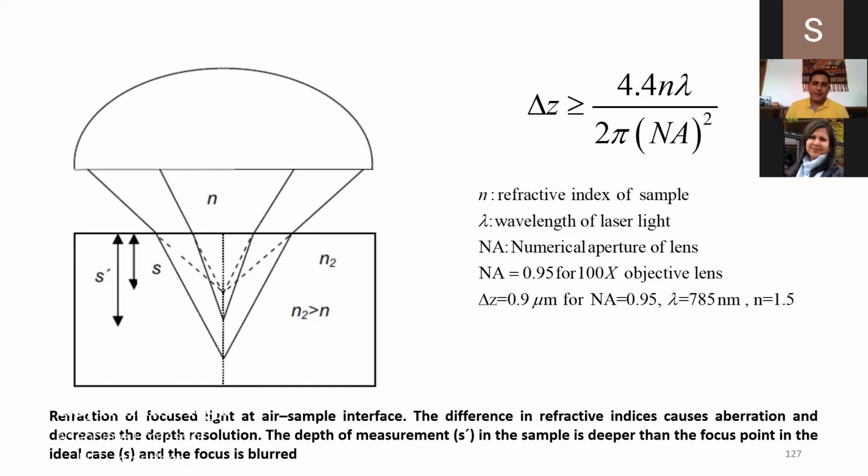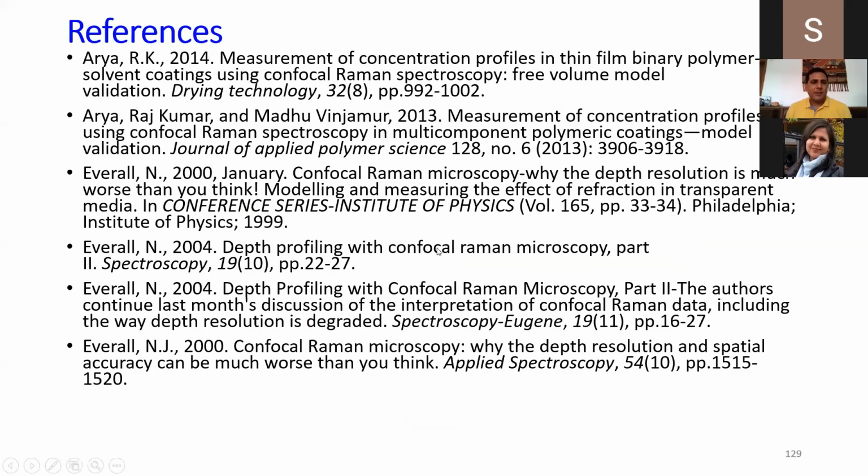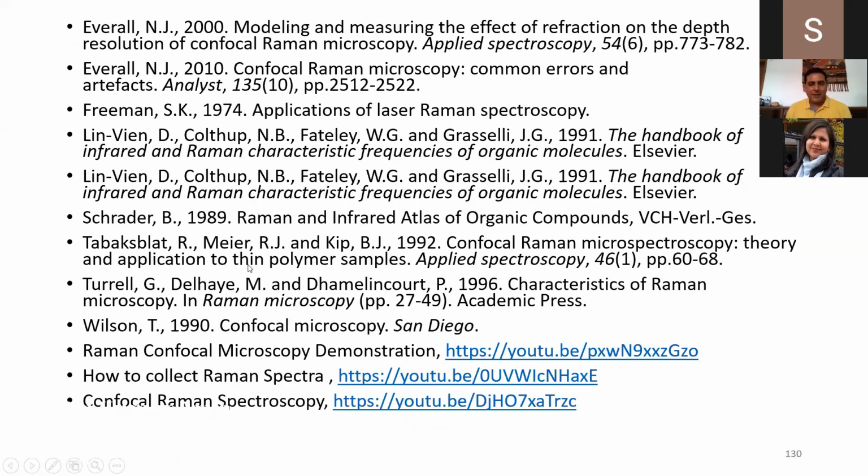Yes, sir. So that way you can control it. Now this is another thing, how this looks. Sometimes people fill up water, sometimes people fill oil, just to make sure there is no refraction of the light. Okay, now this is some reference.